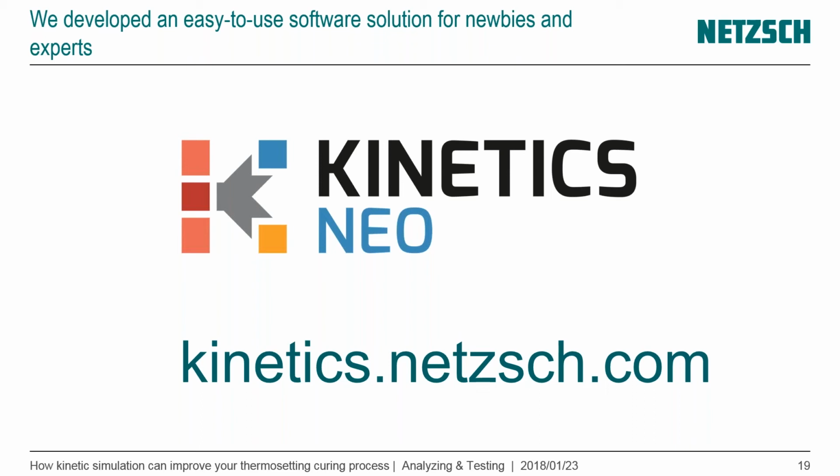Do you already use kinetics software? No. Okay. During kinetics modeling, you can fix parameters. So you can do the first model, you can find a quite good fit, and then you can fix 1 or 2 parameters that will never be changed by a further adaptation of your model. So you can fix parameters, and then you can find out how activation energy and pre-exponential factor are adapted to reach this very good kinetic fit of your material data, of your measurement data.